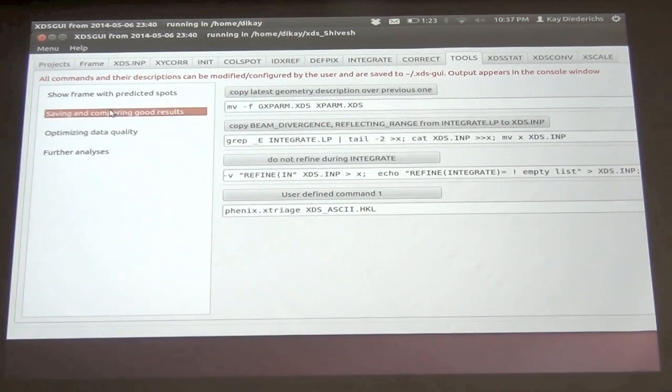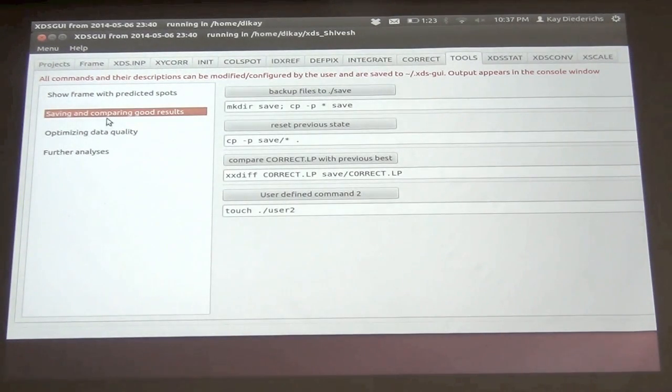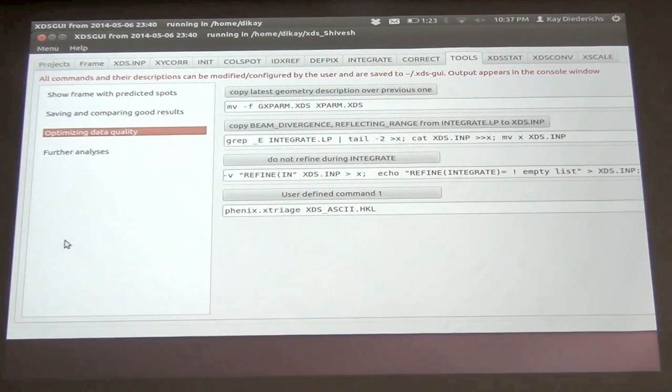And all the other things that are already prepared for you to use, you can change them just by changing these little bash commands here. They do those things that you would normally do on the command line. So it's all in one place now, very easy. And, okay, time is over, I guess. It's that time.